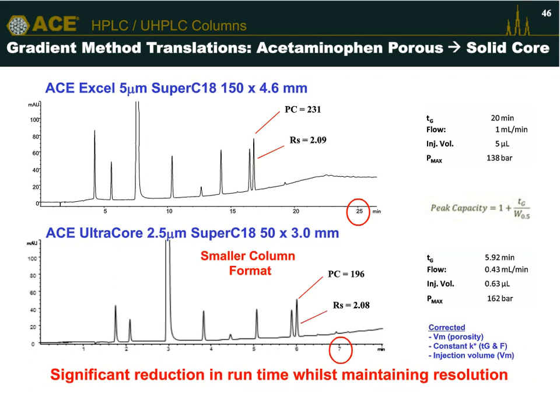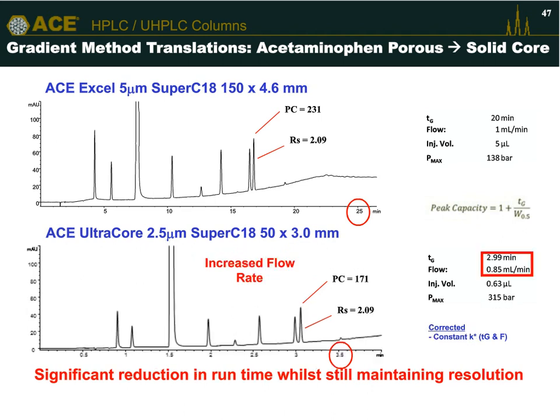Now with this separation, the top chromatogram is the original separation, and the bottom one we're going to an even faster separation this time. And now we can see we're maintaining the quality of the data by giving full separation in less than 7 minutes, and we can do it again in less than 3.5 or 4 minutes, giving us full separation of this complex mixture.